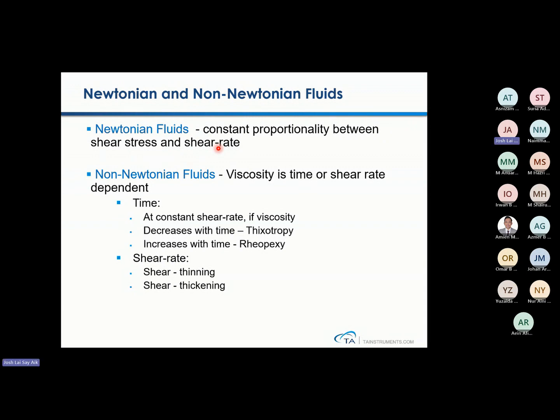But of course, when you start to add particles inside the oil, or add some structures, modifiers or additives inside the oil, it will become non-Newtonian. Because the oil is being structured, it gets thicker, and the viscosity will change when it is exposed to different shear rates, or different shearing times. So all this will have a very specific name for your sample.